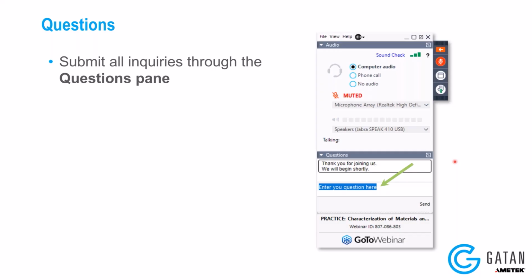Okay. The next question is, does STEMx OIM work for multiple kinds of crystal structures, more than just cubic? Yeah, so you can use essentially any kind of crystal structure for the analysis. The way that works, I mentioned at the start of the presentation, is that you'll have a crystal structure that you load into the DigitalMicrograph software. That crystal structure is typically a CIF file that you can get, for example, from the Open Crystallography database or some other database that you might be using for EBSD analysis.